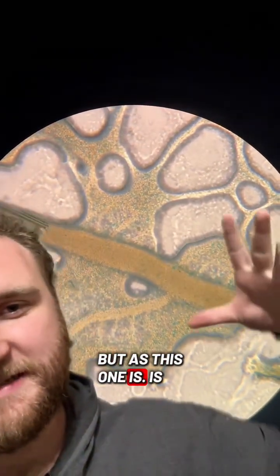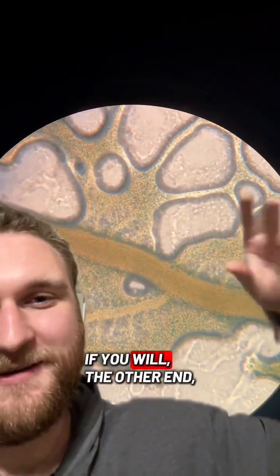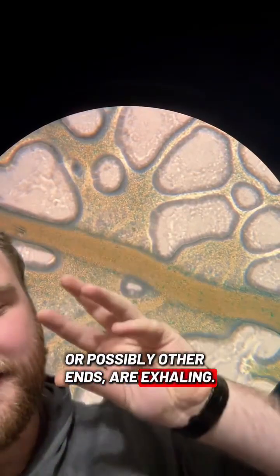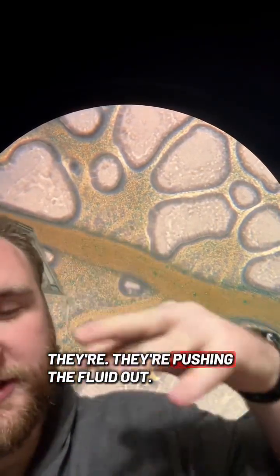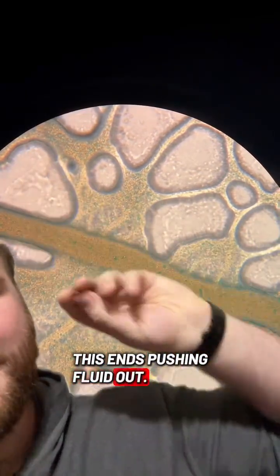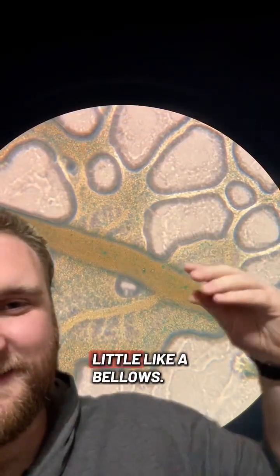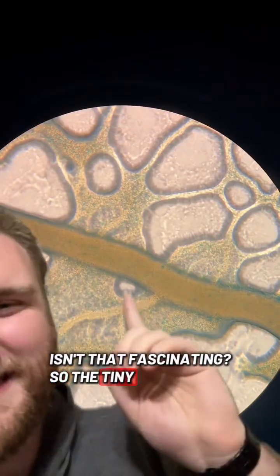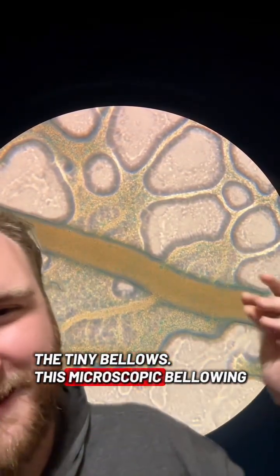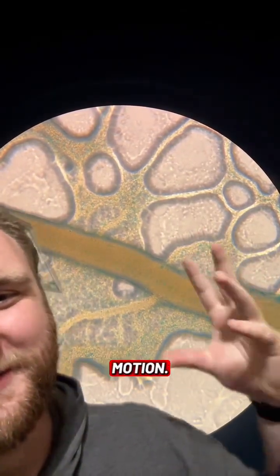But as this one is inhaling, if you will, the other end, or possibly other ends, are exhaling. They're shrinking, they're pushing the fluid out. So this one's pulling fluid in, this end's pushing fluid out, and it starts to look a little like a bellows. Isn't that fascinating? So the tiny bellows, Physarum, the tiny bellows, this microscopic bellowing motion.